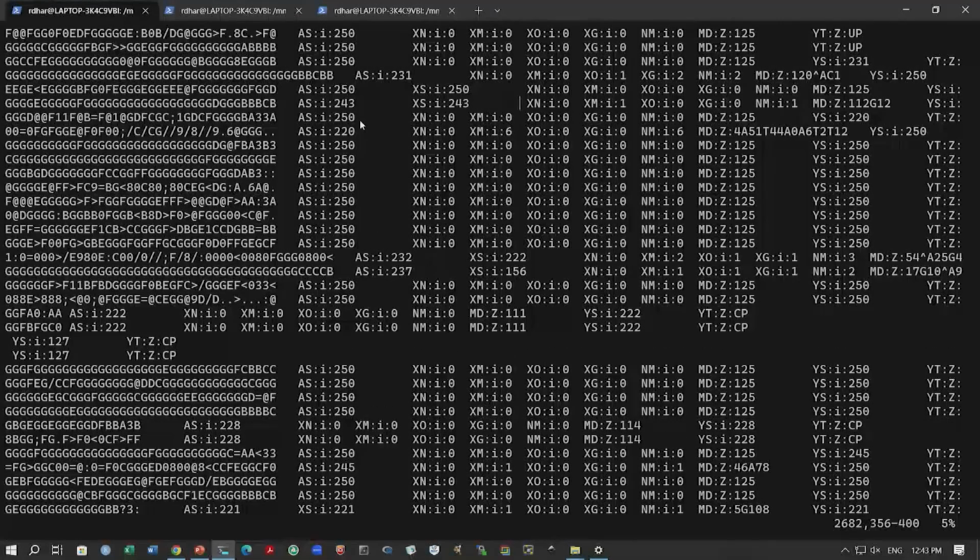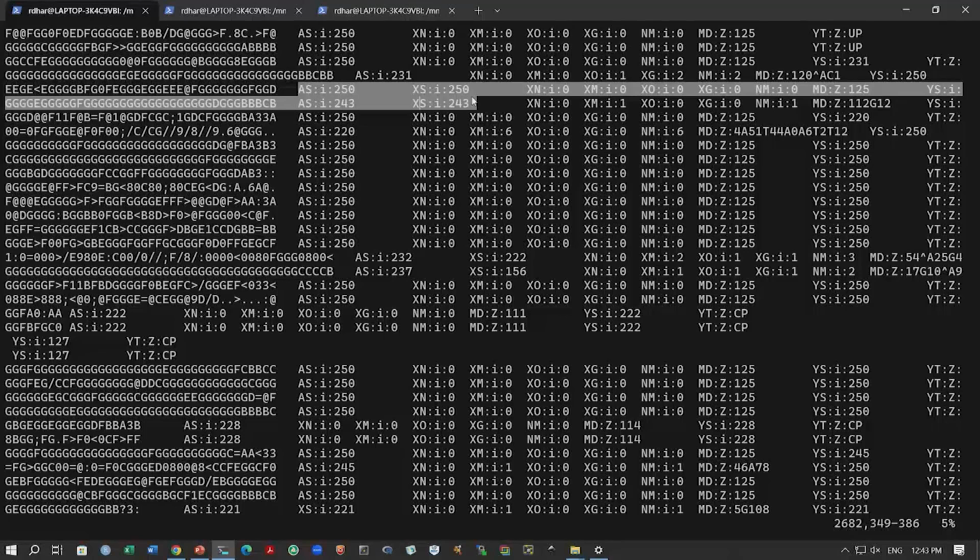And in some cases, for some reads you can see this XS field, right. So, you have this AS:i, XS:i, and in this case what you see is that the alignment score and the alternate alignment score are actually the same. Okay. And in these cases you would have to be careful, because this means they are mapping to repeat sequences, right, and the alignment score is exactly identical, right. So, that means they are probably showing exactly the same alignment. It is not like one alignment is better than the other, they probably have a similar number of mismatches, etc.